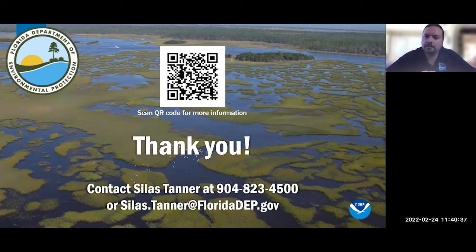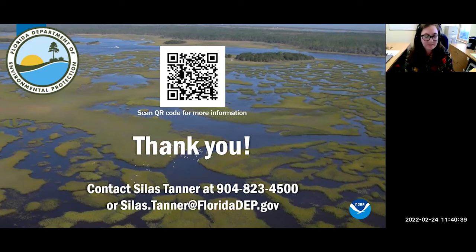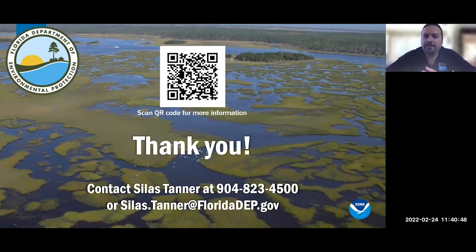Great, thank you. Would you be able to give some information on the cost of the data sonde versus the extraction method? Sure. The price of the extraction method is going to vary between labs. The sensor is about $3,000. It depends on the longevity that you're going to get out of the sensor.